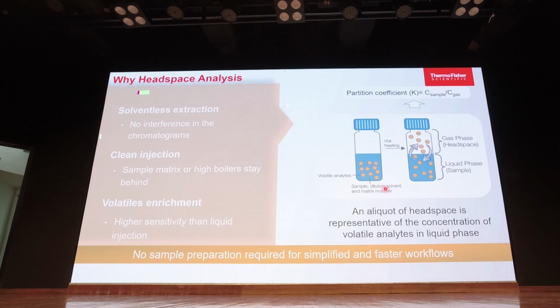So we are using headspace. Headspace is nothing but we keep the liquid in a vial, and when you incubate this vial, the volatiles come into the gaseous phase, and then you transfer this vapor, keeping the matrix down. So GC is suitable for volatile species, and you can inject it. But here in IIT Bombay, we have a facility which is more sensitive than this headspace.